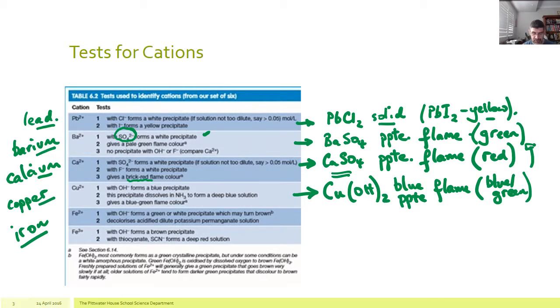Okay, it's always difficult to talk about ions, and it makes it more difficult when there are two. These ones both are going to be useful for testing with the hydroxide ions as well. And the main reason for that is that we have two different colors.